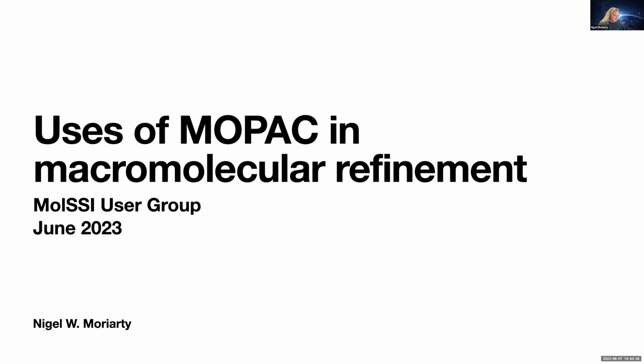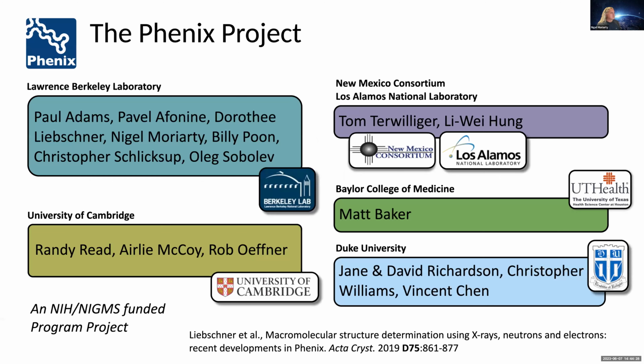And one of the cool things I should tell you is that Phenix is a large project of several different groups, and we work together to create a software package so that both academia and industry people can refine their proteins or actually macromolecular models so that they can find out what's in their crystal. It's similar to, I'm sure, what the previous speaker has done.